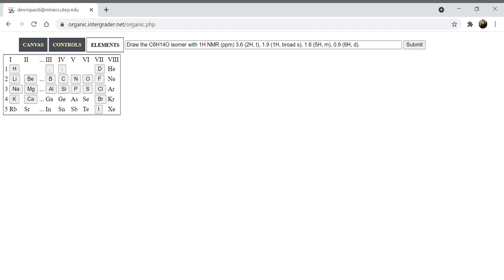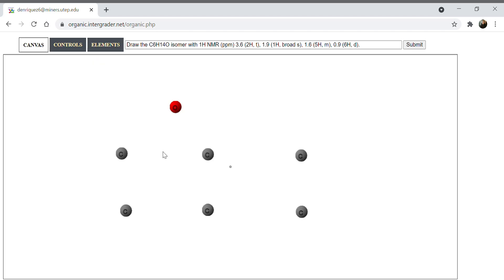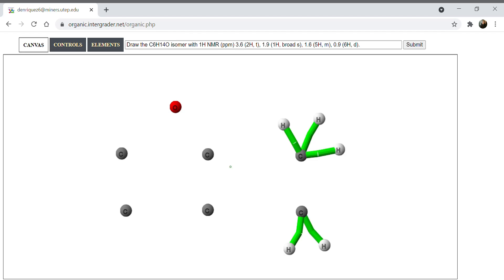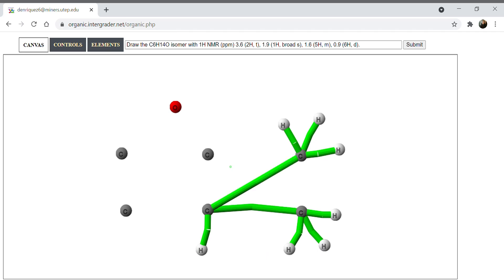I see 'broad s' so I added my oxygen to the canvas. I'm going to switch to hydrogen and add my six hydrogens total to two of the carbons. Then it's connected to a double, which means it's going to be a carbon with one single bond. Whenever it's single it only has one hydrogen. I connect both of the carbons to that because I want to keep it as only having one hydrogen.